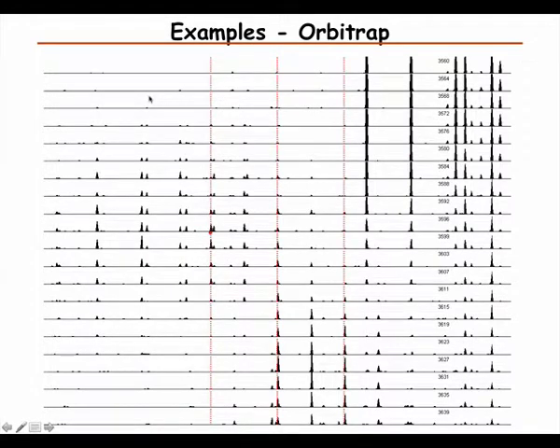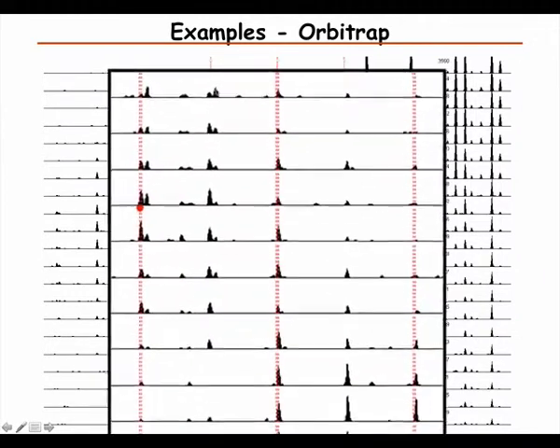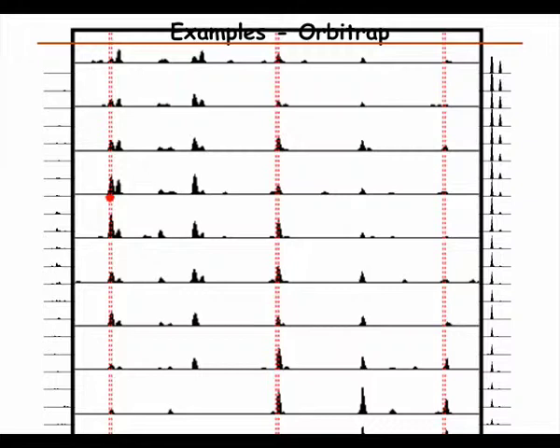But also here in another area we see that the three red lines are our peptide of interest, but there is actually also a lot going on here, and the three peaks don't correlate very well with each other as a function of time. So even when we have very high resolution, we will get interference.